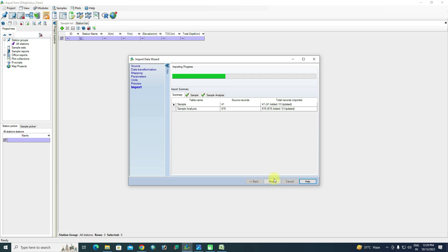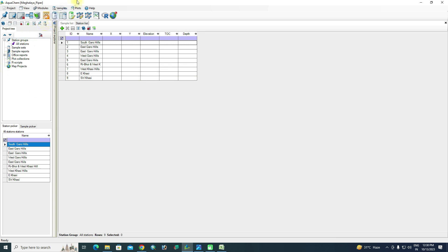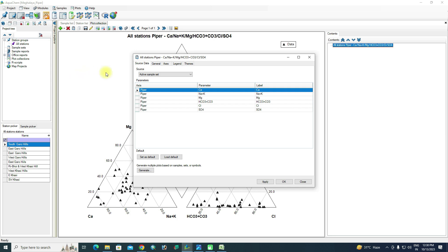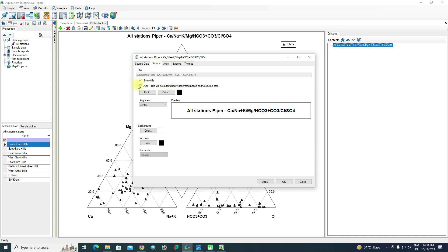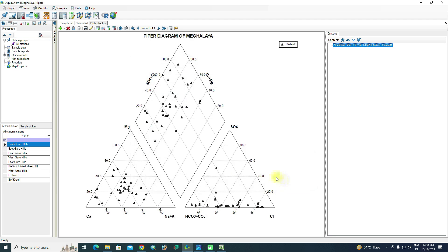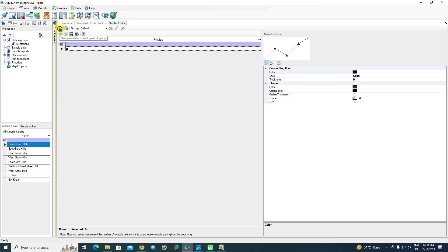Click Next and then Import. The data import completes: 41 rows containing 615 values have been imported. Click Finish. The district names now appear. Go to Plot, then New Plot Collection, click the plus sign, and select Piper Diagram. In General settings, uncheck the Auto Title option and enter your title — I am using 'Piper Diagram of Meghalaya'. You can change font style and color. Click Apply or OK.